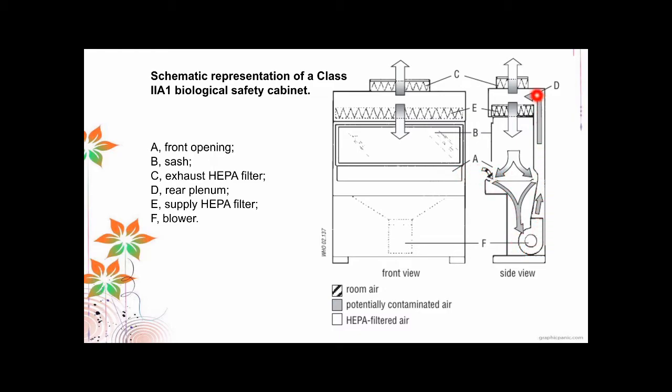And then there's a blower. You have two HEPA filters. The HEPA filter that directs air outside, the exhaust here, is of course also filtered, and another filtered air goes to the inside of the area, which is basically your workbench. So your workstation or work area receives cleaned or filtered air.